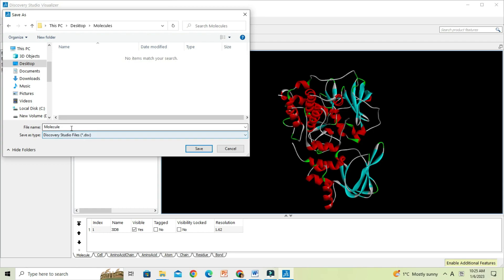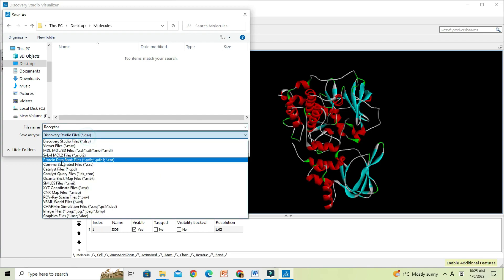This clean protein structure, now we can save as a PDB file for further downstream analysis, such as docking studies.